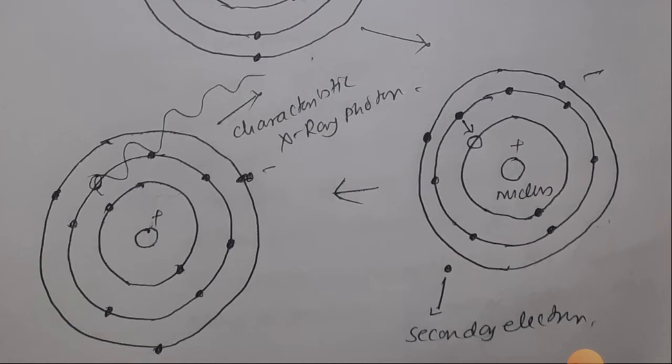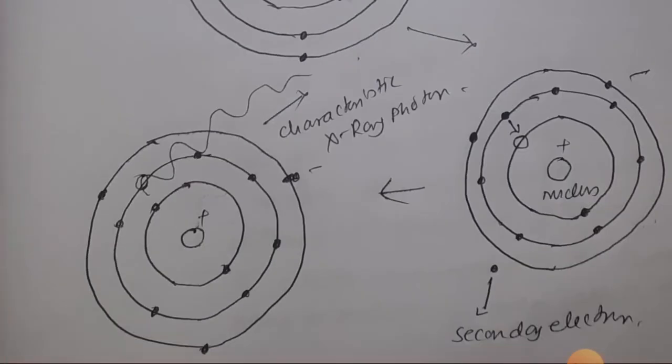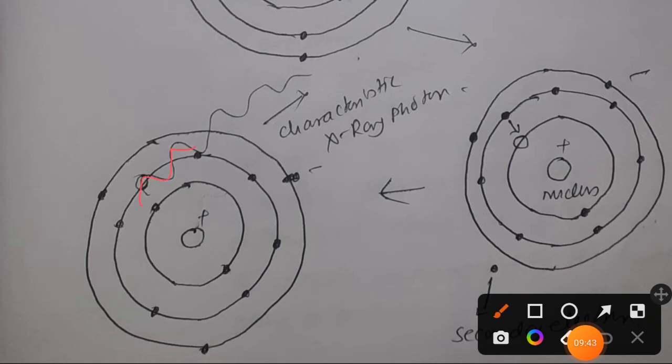That means, let's say we are visualizing a cell and our primary electron hits it on its nucleus. Under such circumstances the energy which is emitted has a specific characteristic wavelength, and that will be detected by the X-ray detector, which is an additional detector present in scanning electron microscopy. That means two types of detector are present in scanning electron microscopy.